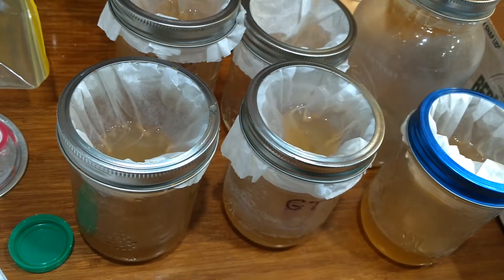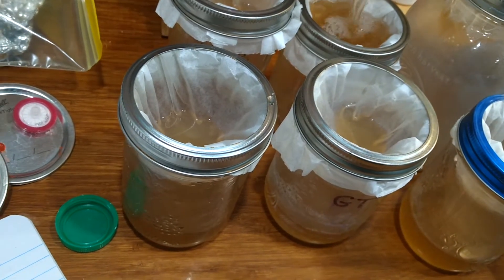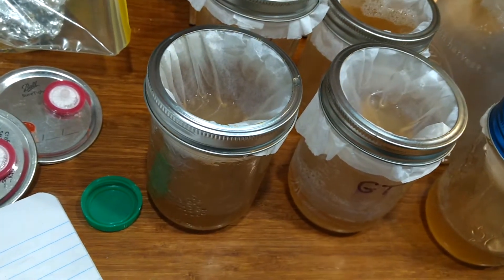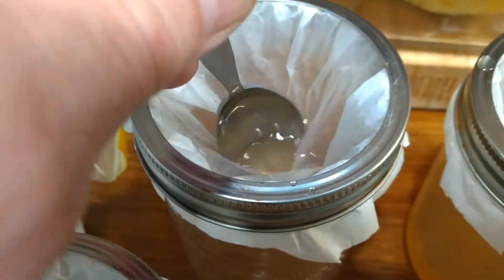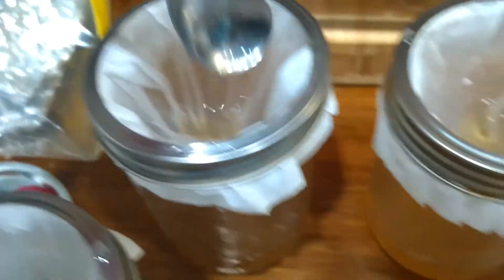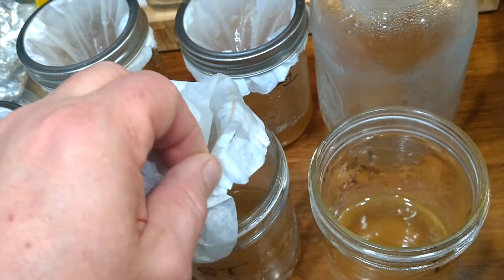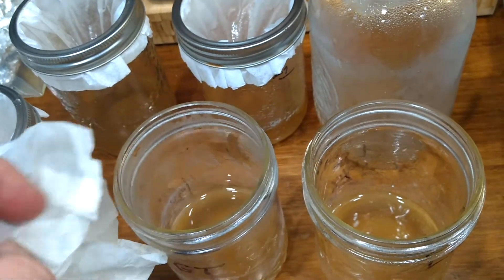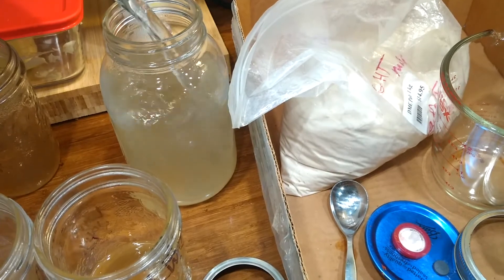Take a spoon and swish it around to make sure that a lot of the water is down into the jar, as you can see I'm doing here. Try not to poke a hole in the coffee filter — they are very fragile. Remove all of the filters from the jars and then top it off with distilled water.